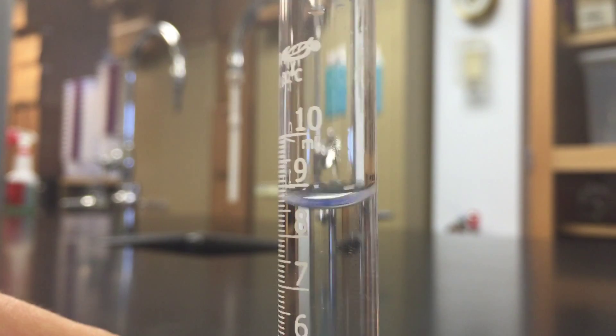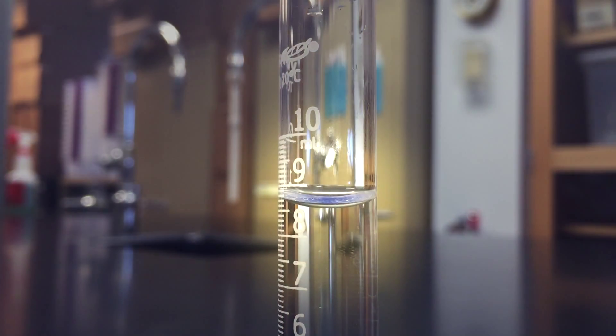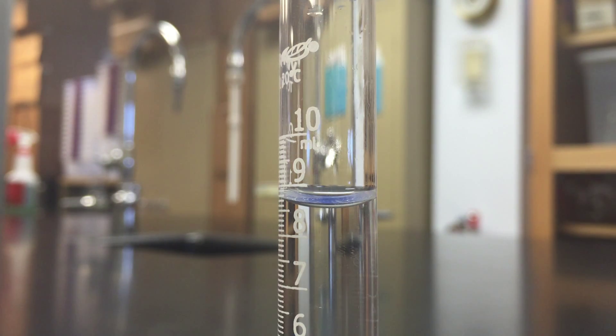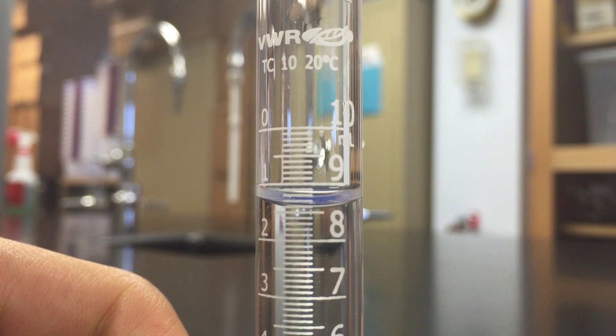Learning how to read a meniscus is a very important lab skill. You have to be at eye level to read one, and you always look for the bottom of the curvature. Sometimes it helps to put your finger behind it so that you can see the exact number better. In this case, it's about 8.59 or 8.6.